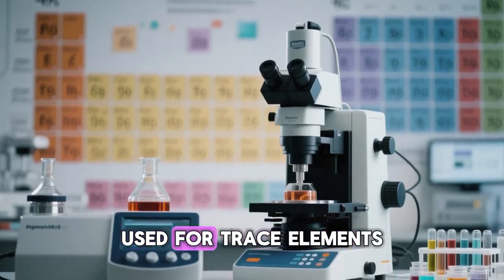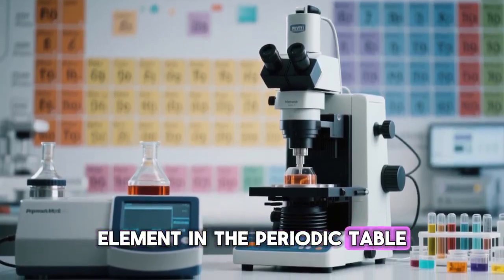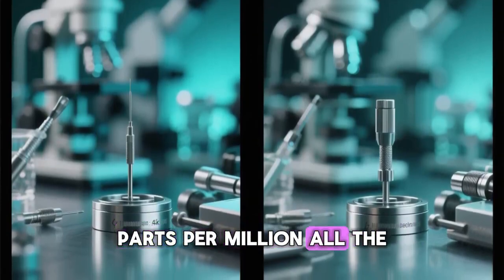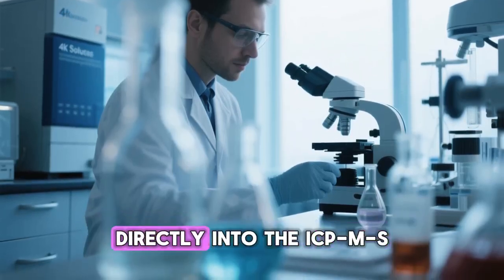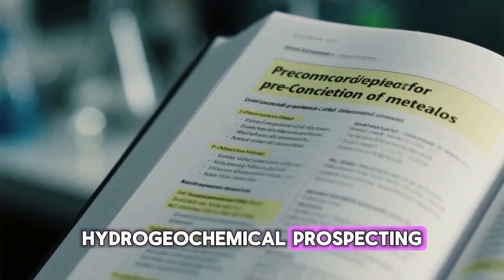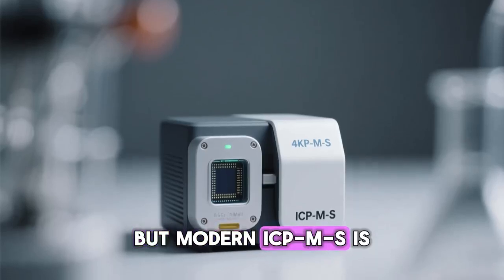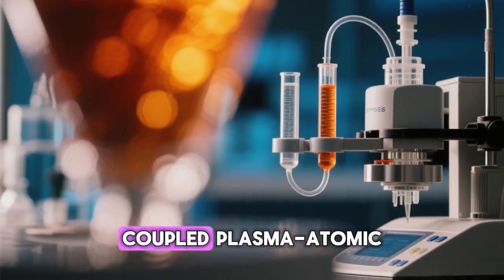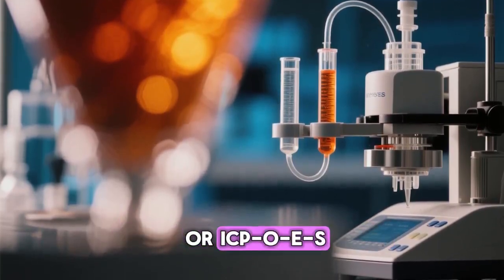ICP-MS is primarily used for trace elements and rare earth elements. It can analyze almost every element in the periodic table. Its key advantage is its incredibly low detection limits, which can range from parts per million all the way down to parts per billion. The solutions from our sample digestion are introduced directly into the ICP-MS. For analyzing water samples and hydrogeochemical prospecting, older methods often required pre-concentrating the trace metals, but modern ICP-MS is so sensitive that this step is often no longer needed.